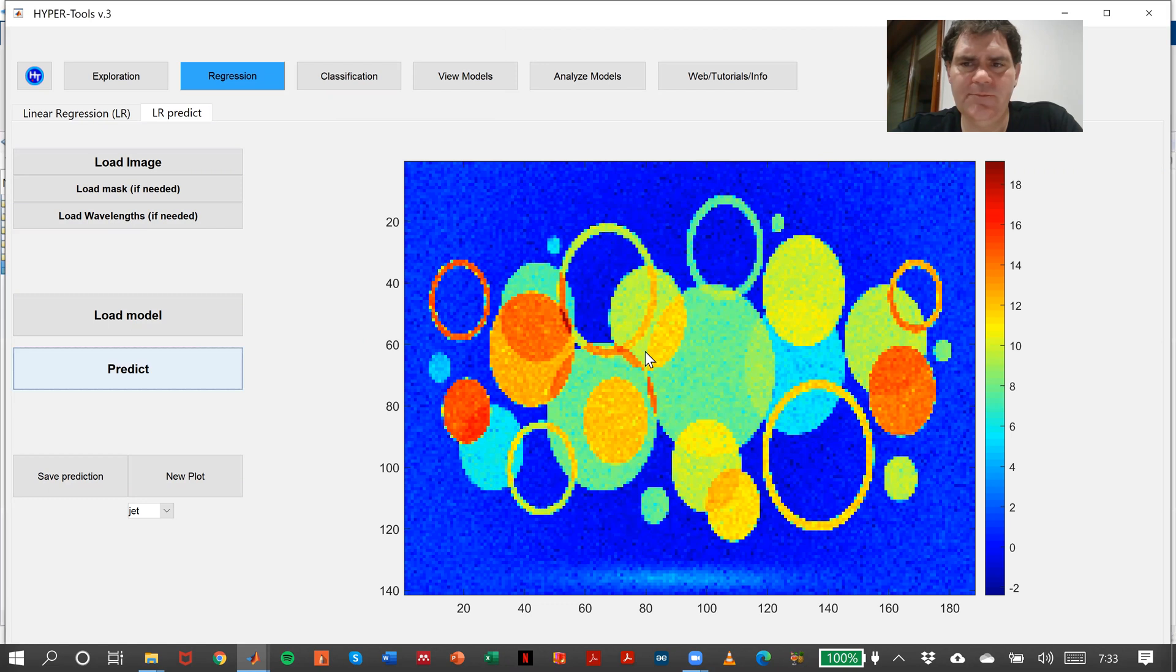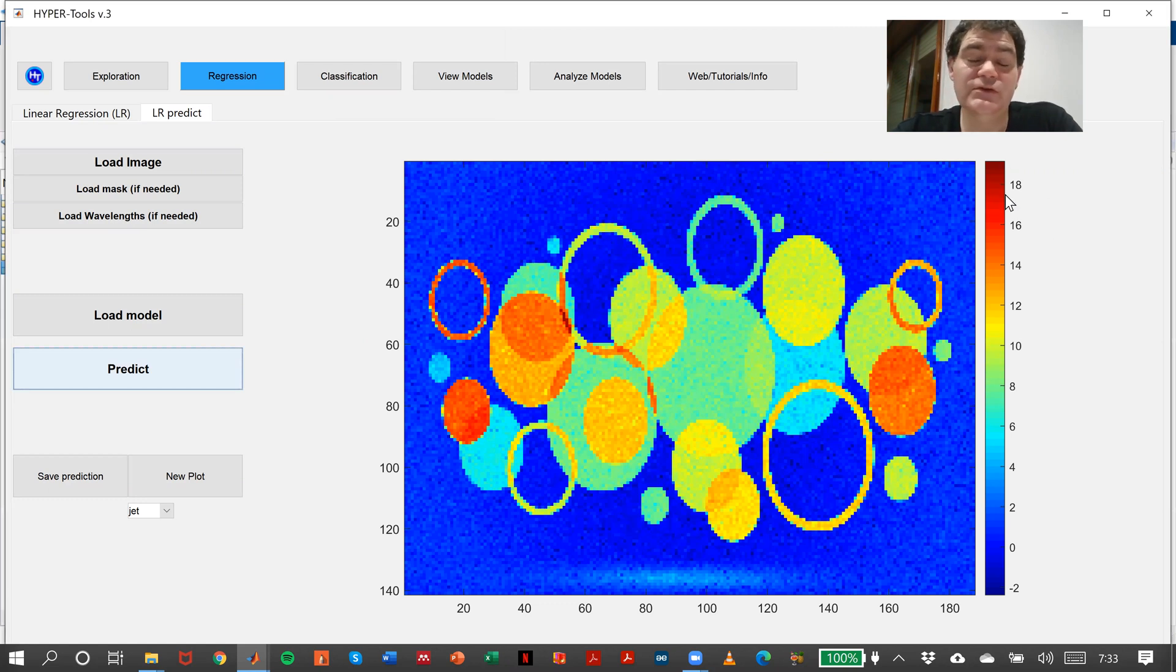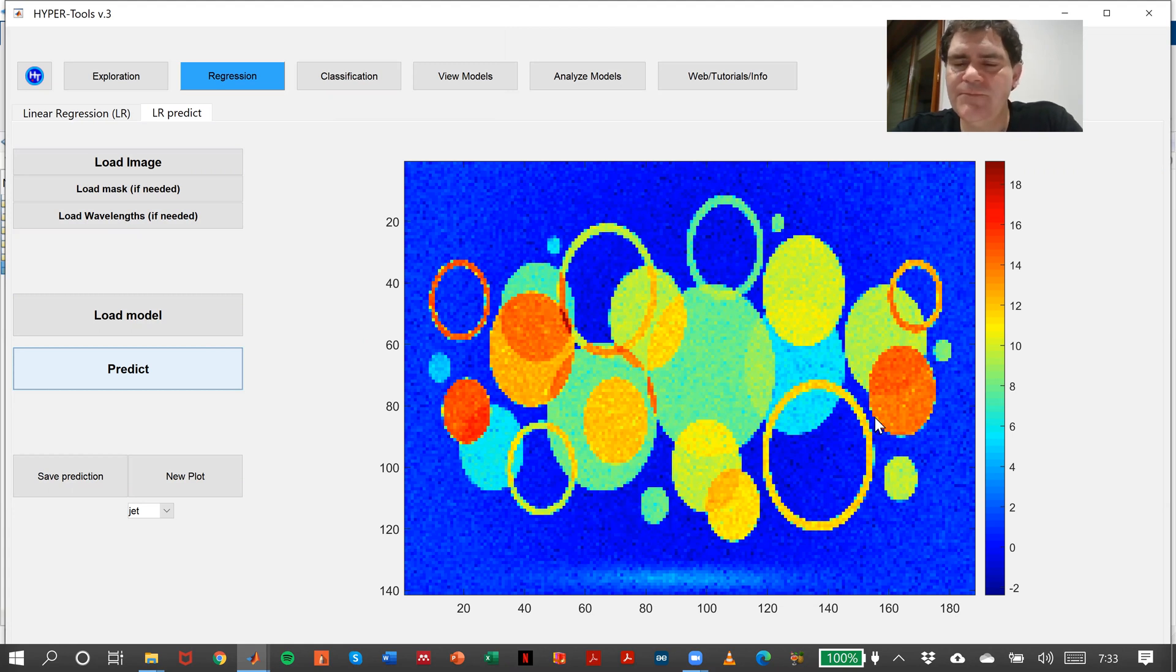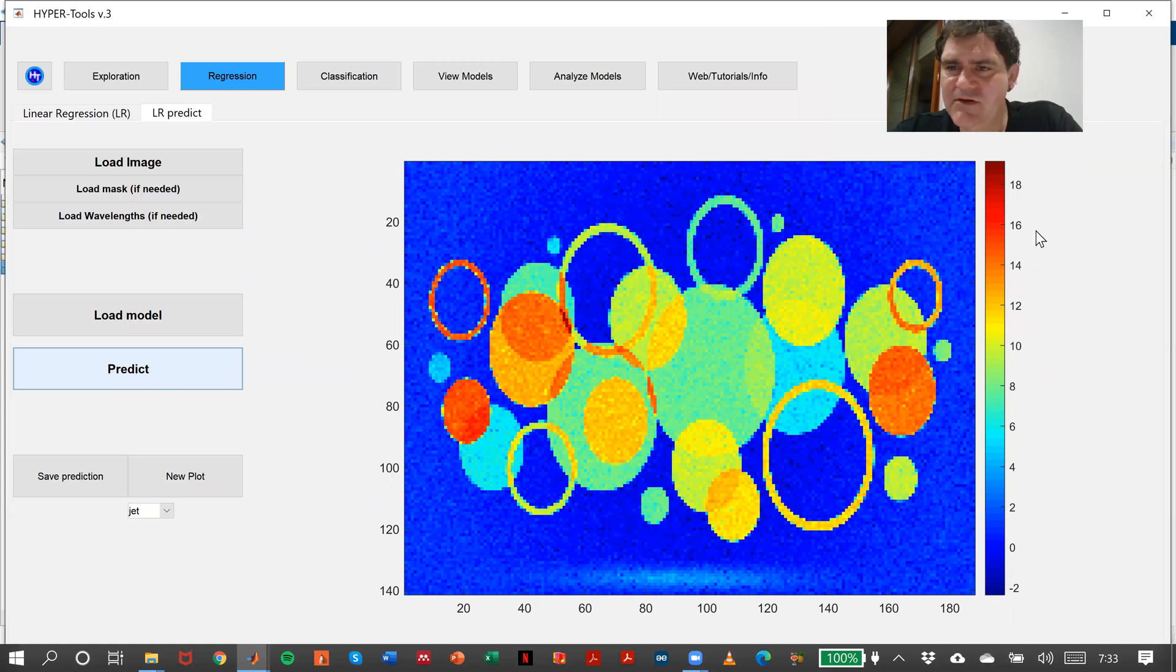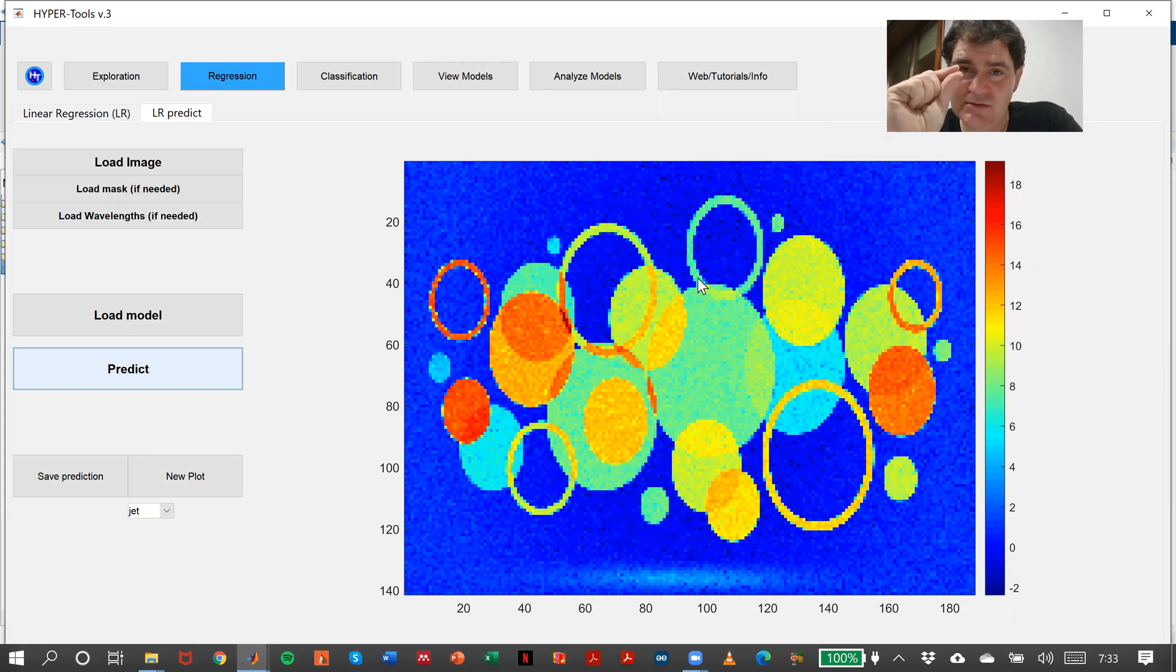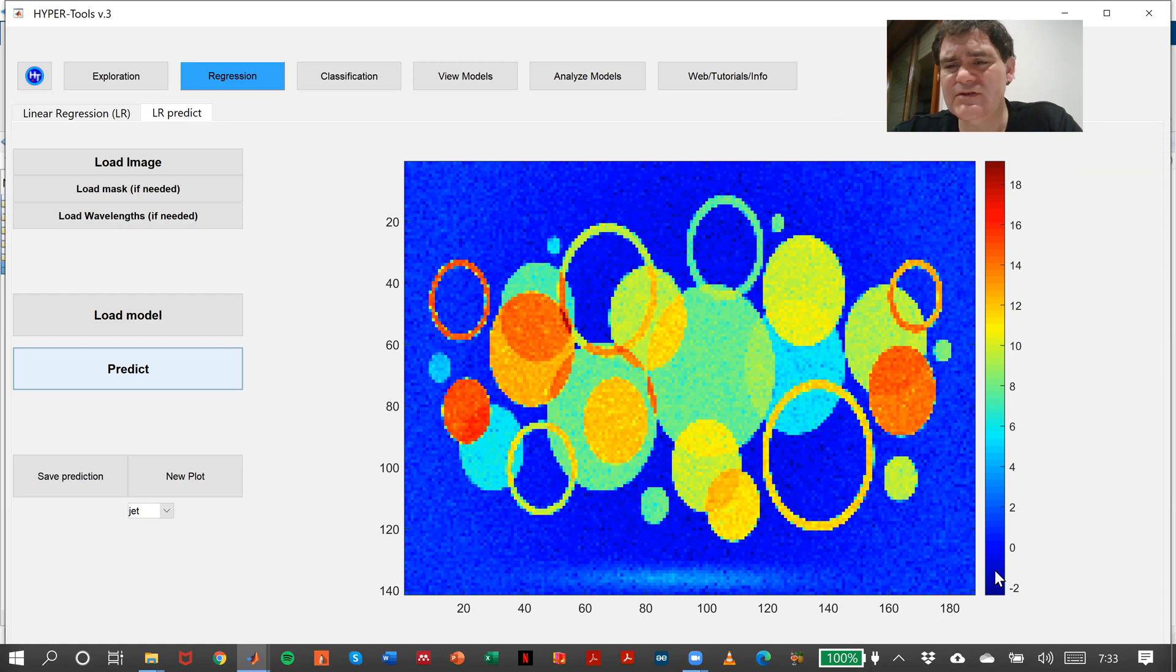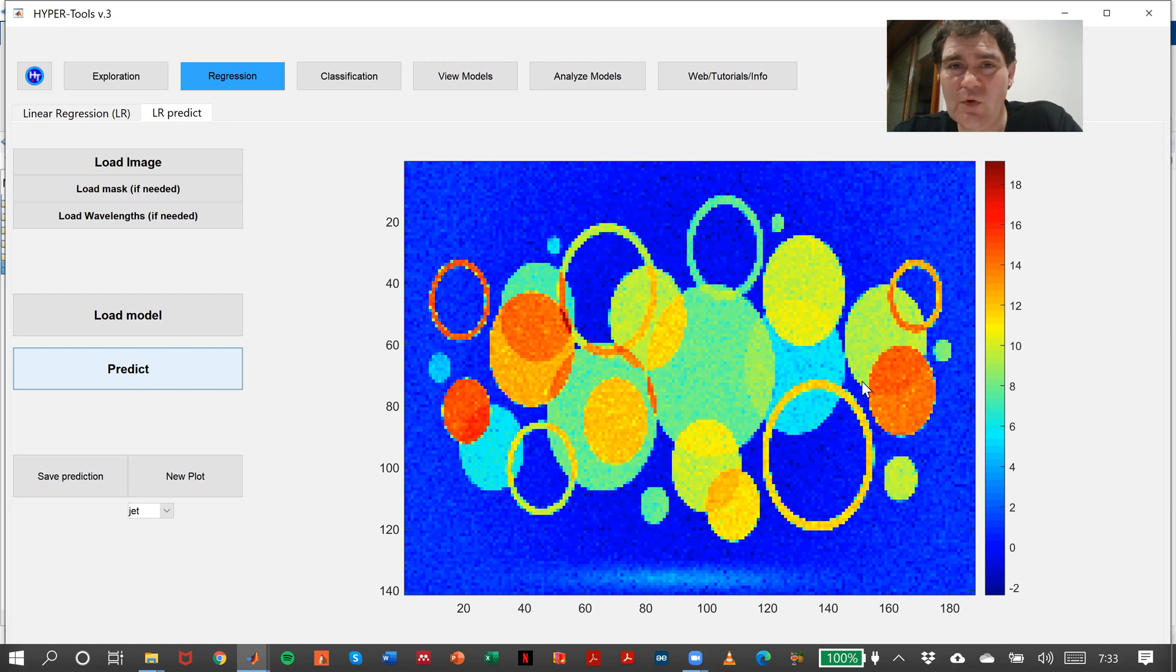There you are. What we have here is the obtained concentration for every single circle, every single area. One thing I want to highlight is that the calibration range goes between 5 and 15, and we obtain higher concentrations here and lower concentrations here, and that's perfectly normal, perfectly fine.